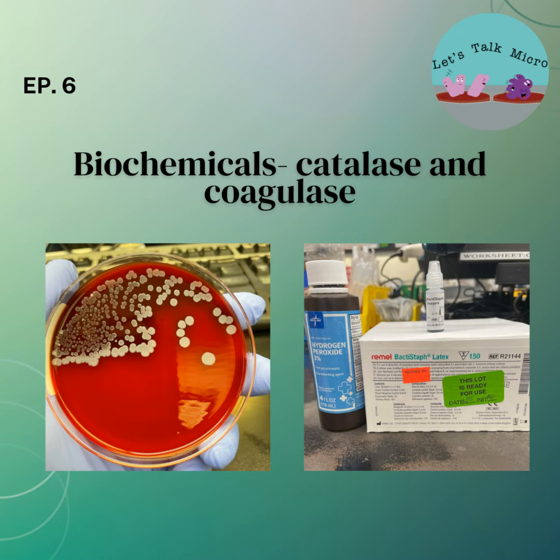But if you have it as a part of an enteric sample, of course, with the exception of O157 and the other subtypes, then it is not pathogenic. And this is one of the things that you keep in mind when you work in cultures. Sometimes you might see wound cultures from an abdominal or enteric source that are full of Enterobacteriaceae. At that point in time, you focus on the ones that are oxidase positive, that are more resistant in nature to antibiotics. You work up any beta strep, any Staph aureus. So always keep in mind the source.